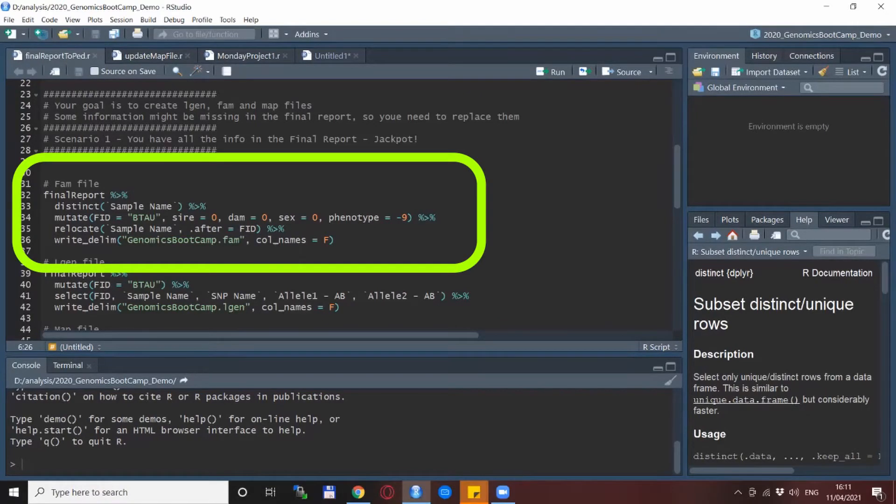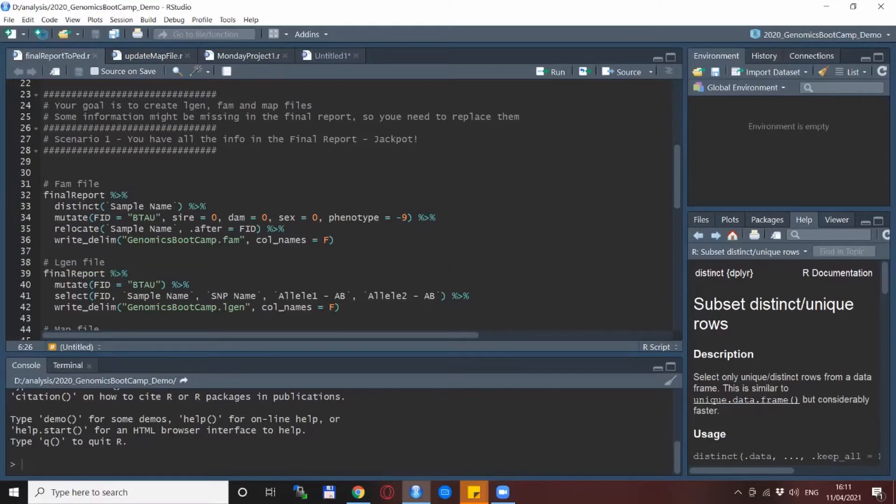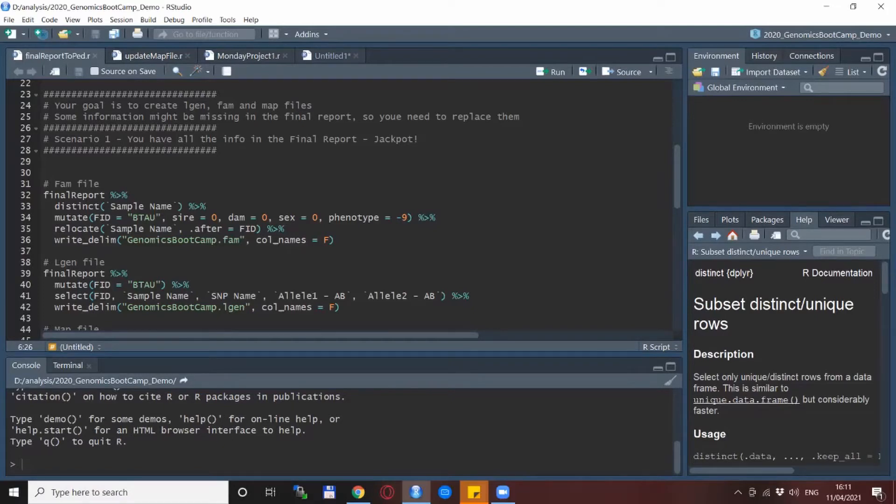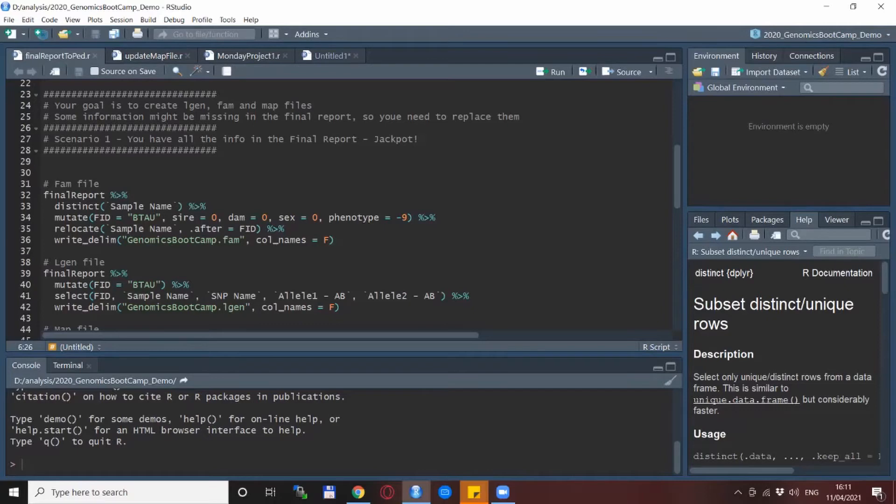So as for the FAM file, so this is the file when there is one line per individual, so we start with the final report, keep just one line per individual and then add all the other stuff that we need. So we add the FID which is the family ID. In this case I have chosen the name Genomics Bootcamp.